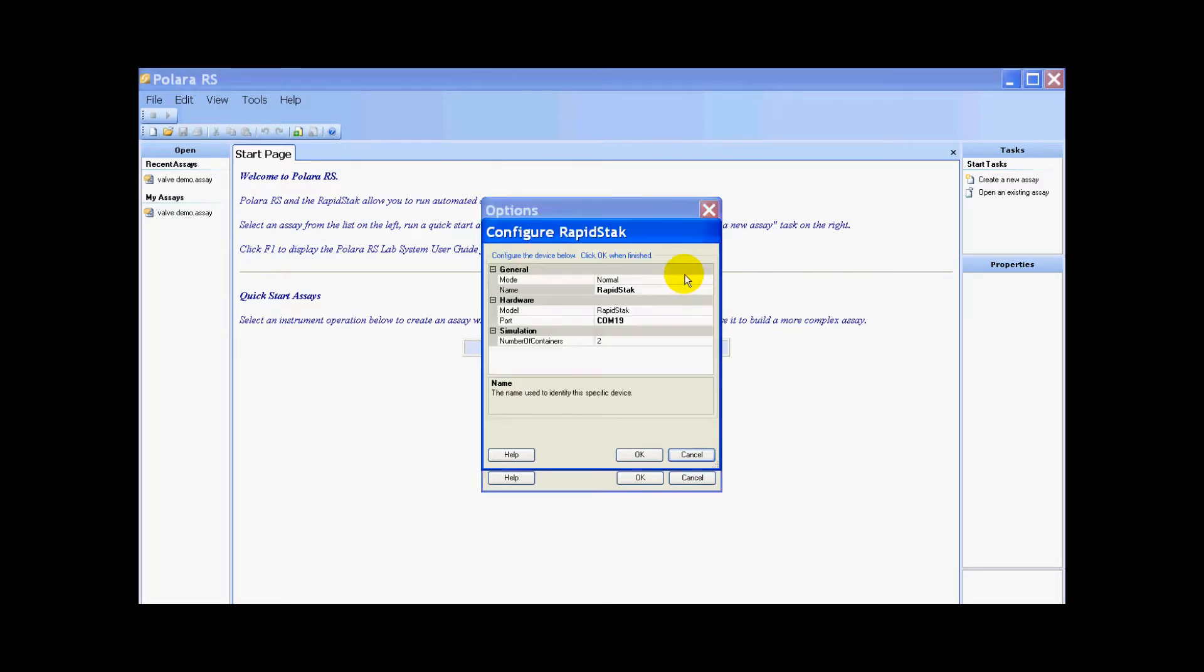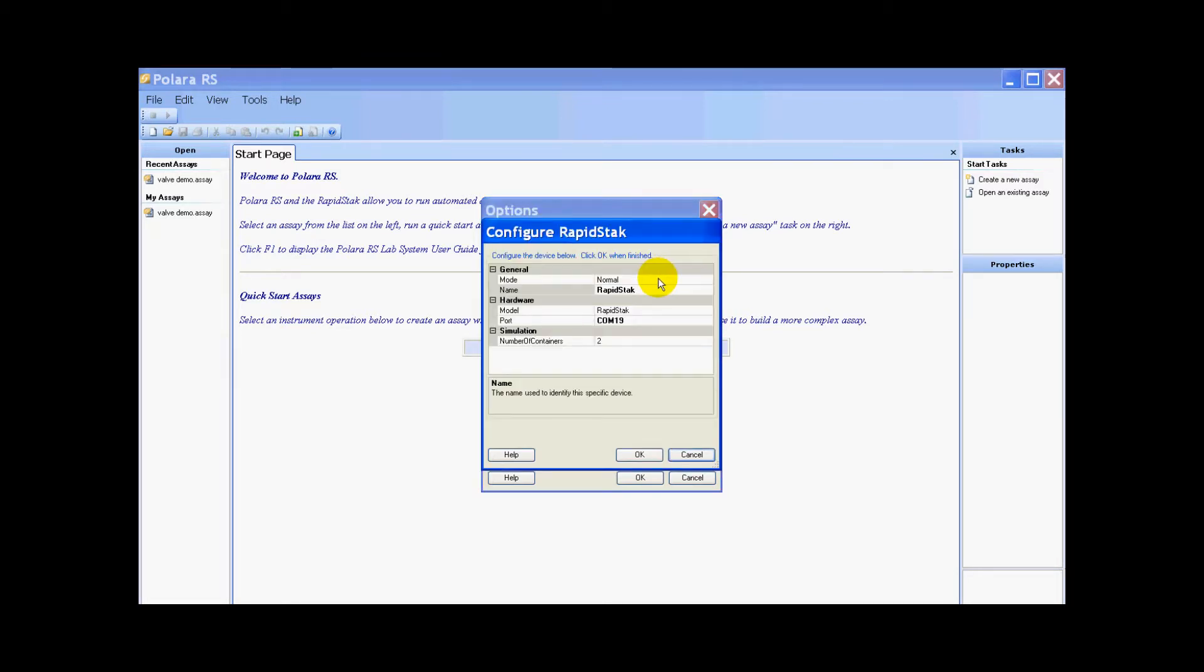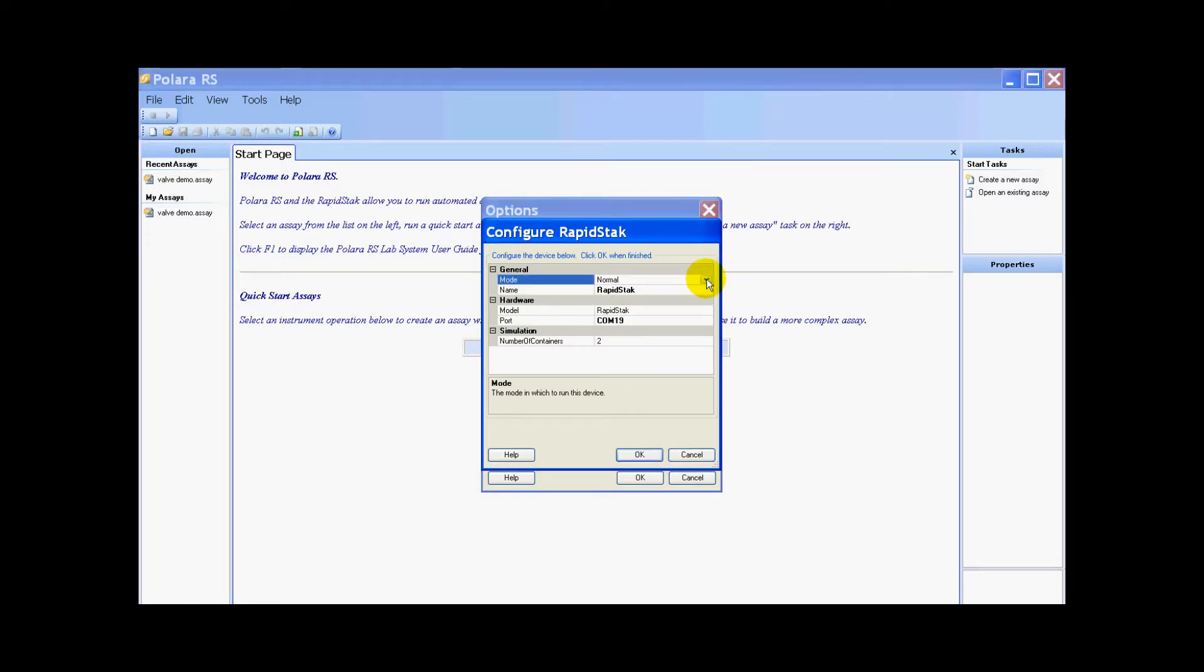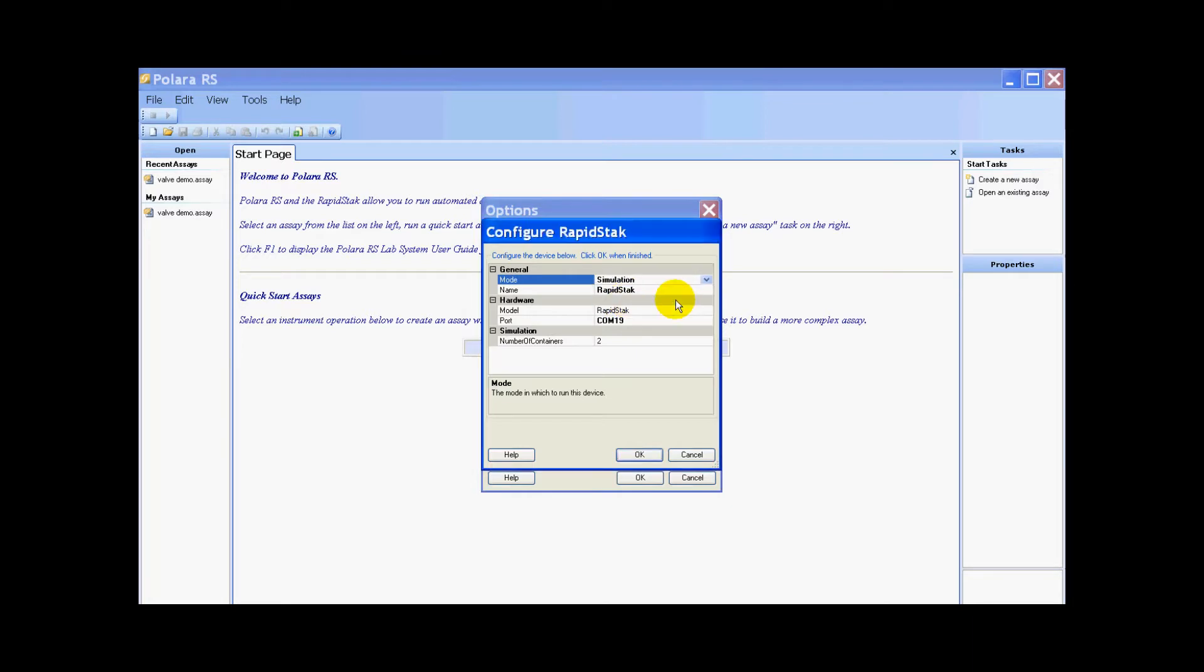We go to the settings and you can see under the settings the mode is normal. The system is going to look for the rapid stack, so we want to switch this from normal to simulation. Now it's just going to think that there's a rapid stack, and since we're on simulation all the other settings aren't required, so we just hit OK.